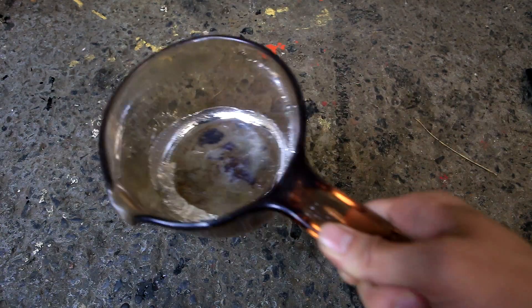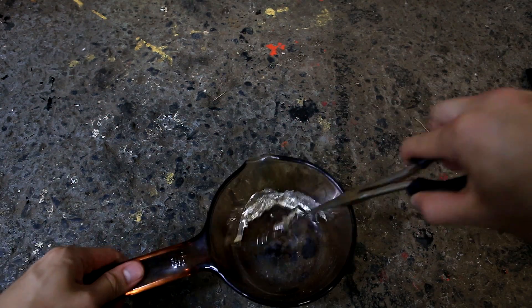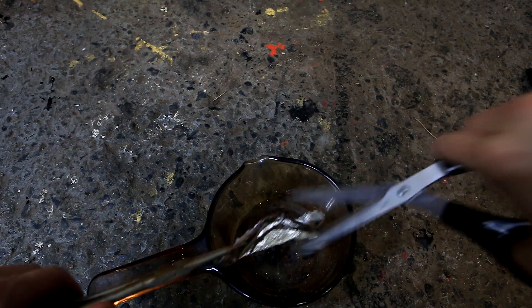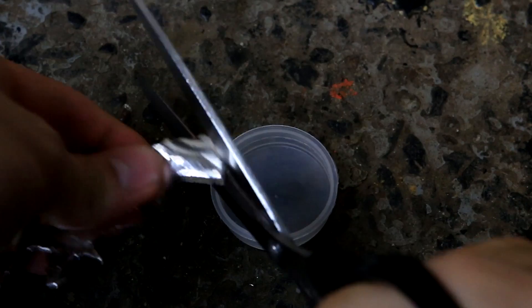One thing to note is that the reaction will go faster if you clean the tin beforehand. The tin was cleaned by melting it in a pot and tilting the pot to pour the tin out from under the oxide layer. The liquid tin was spread out and I was left with nice thin strips that I could cut with scissors.